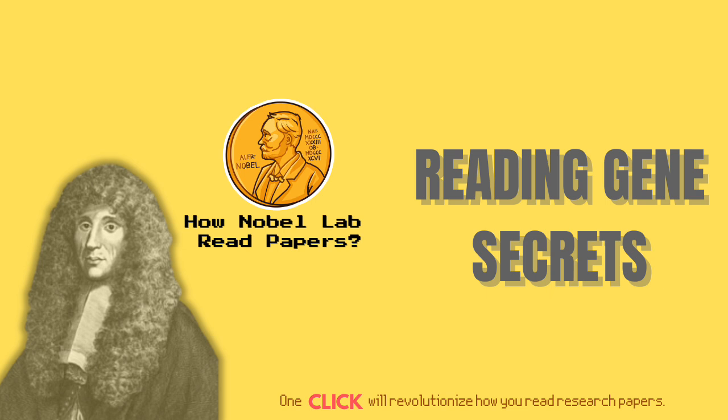So wrapping this part up, why does this paper still resonate so strongly today? What's its lasting impact? Well, theoretically, it fundamentally changed how we think about gene expression. It established this digital counting principle. It's not fuzzy signals anymore, it's discrete counts. And it made it undeniable that things like pervasive alternative splicing and antisense transcription are just normal features of our genome, not weird edge cases.